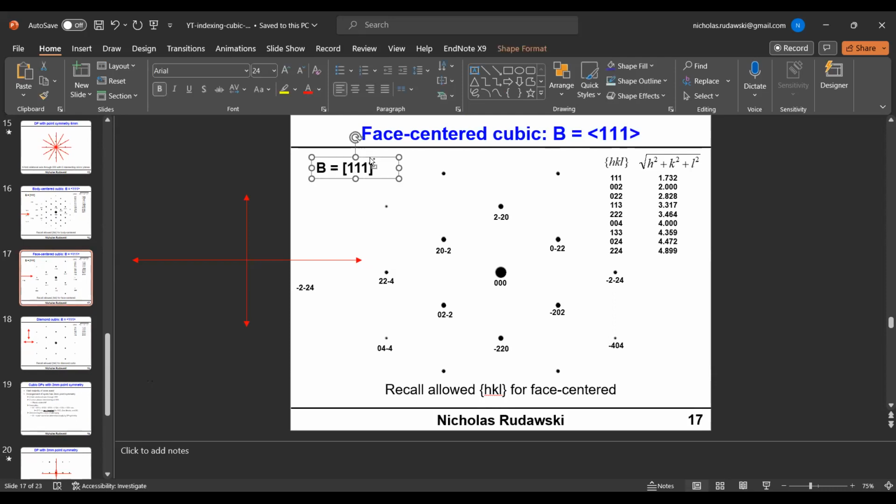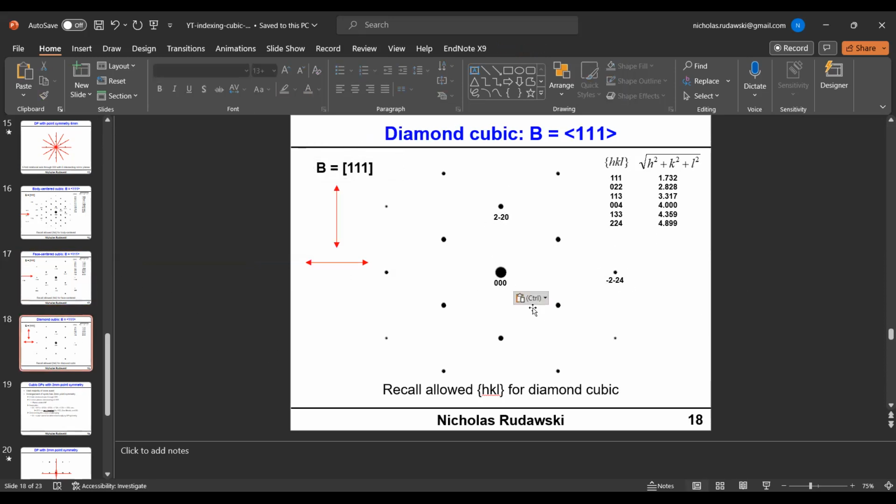But for the sake of argument, rather than just reapplying this, why don't we instead, let's assume that we do it a little differently. So instead of assigning G1 as this, okay, so let's assume instead that we are calling this spot 0, 2 bar 2.